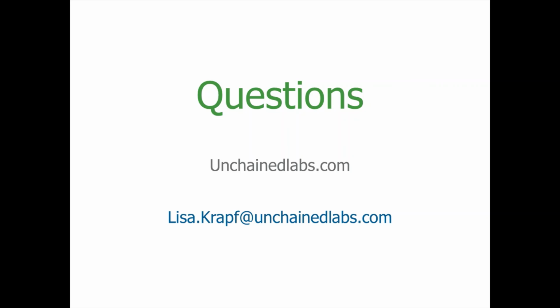Okay. And can it handle polymorphs with different morphologies as well? Yes, that's another application Hound is being used for. An example that comes to my mind: we analyze a mixture of polymorphs, and the composition is unknown, and you want to find out the size distribution of each polymorph in that mixture. The way you would do that is have a reference substance for each polymorph, so that you know the spectra of each polymorph, add that to a database, and then you can do an automated measurement similar to the one we saw for the cream example, where you analyze lots of particles, and get a size distribution for each polymorph.